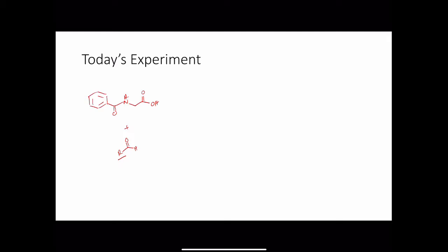So as you'll see, the aldehyde that I've drawn here, I've included an R group. In reality, you're going to be using a number of different aldehydes. That probably varies from person to person, and so that'll change how your NMRs and IRs look at the end of lab. So you might see some extra peaks that maybe your classmates don't see, or maybe you have more peaks than some other people. Okay, so don't get too worried about that when we get to it.